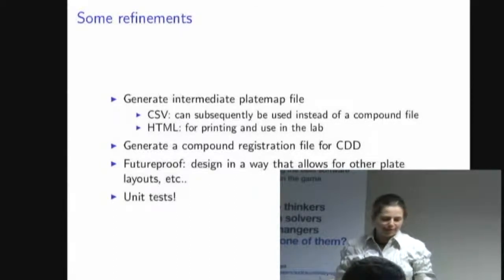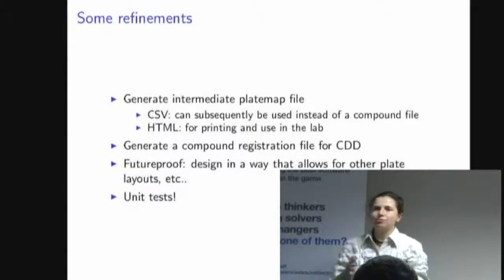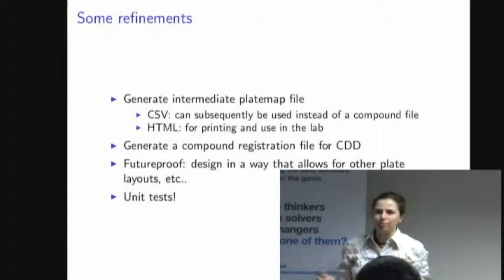And I've tried to design the code in a relatively future-proof way. So right now, the layout is standard and doesn't change, but later, they might decide to do a different kind of assay. So I haven't been terribly consistent, and there are various things which will have to be changed in the future, but I've tried to design it in such a way that it's not going to be completely impossible or very difficult to make adjustments and introduce more variables.